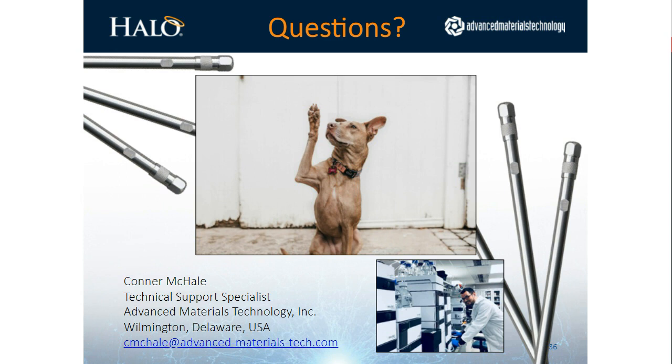Now keep in mind, there is a shelf life for the lamps, so they're not going to last forever, even if they're sitting in a drawer. So I don't recommend keeping a big supply of lamps in your lab. We typically keep about 1 or 2 in the lab, and take it from there. But if it is literally a brand new lamp and you're still getting some poor signal, I would look into either cleaning the flow cell or just quickly swapping it out to see if you get any improvement.